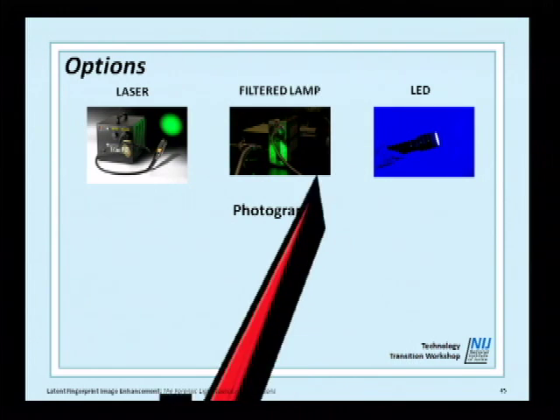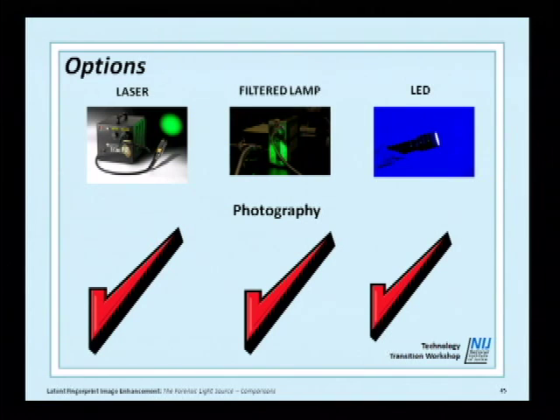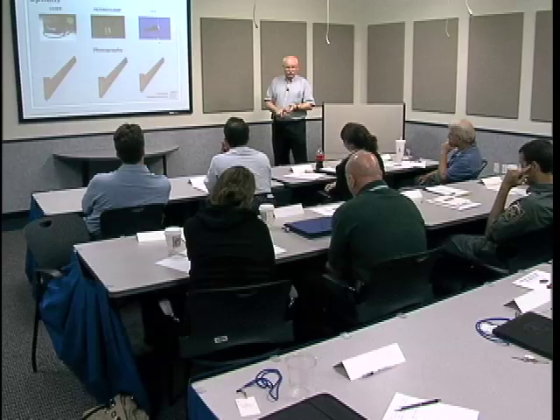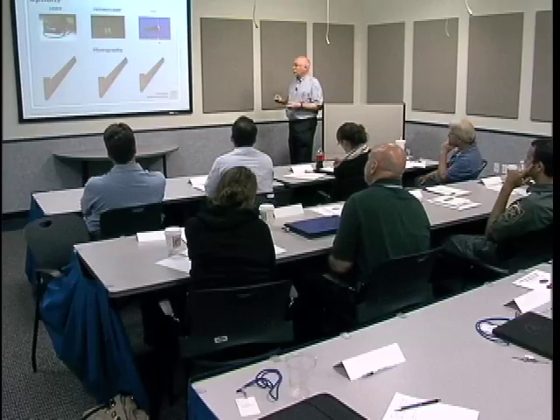In terms of photography, again, there's not a lot to choose here. The LEDs are very powerful. In fact, it amazes me that for something that small, these handheld sources, and you've got the Crime-lite, you've got the Flare Plus, which we have here to look at, but they're all generically very impressive. And then the Ultralight, which I call a bent one. Anybody have one of those or have seen it in operation? Yeah, they all work. They all do a good job.